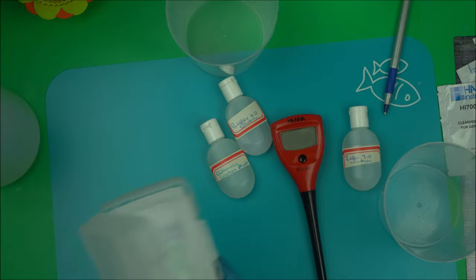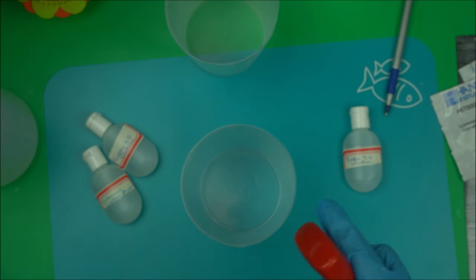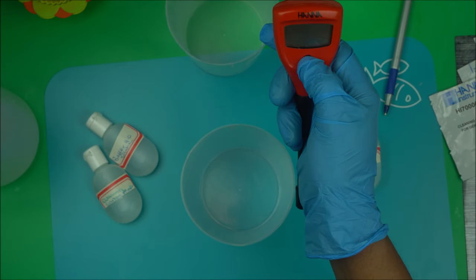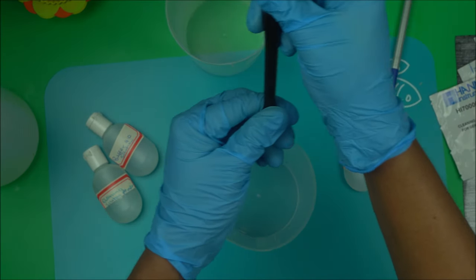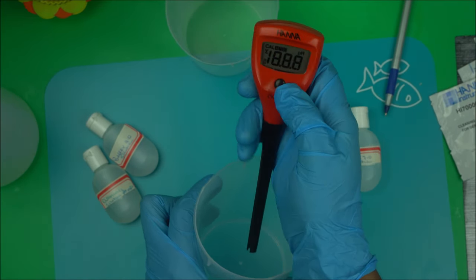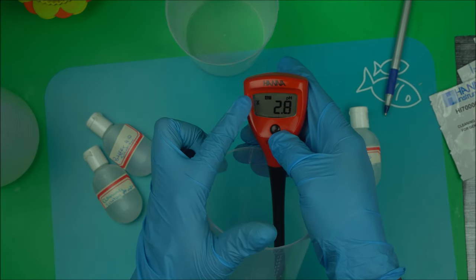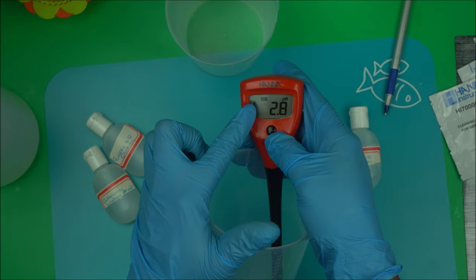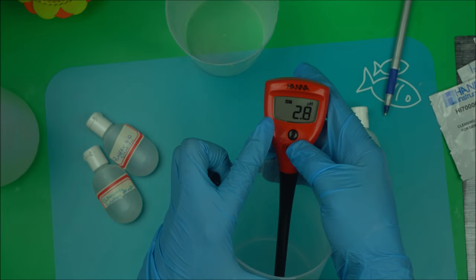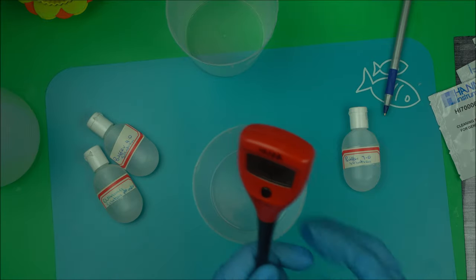To check the pH of your solution, you turn on the pH meter, remove the cover, and dip it into your solution. There's an indicator that shows it's working, and once that indicator goes off you can take your reading. Check the description box below for how to use a pH meter to check the pH of your product.